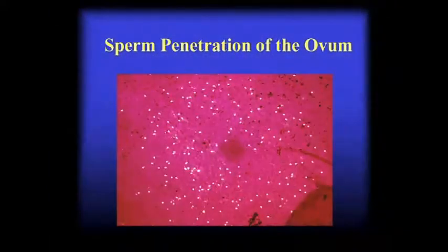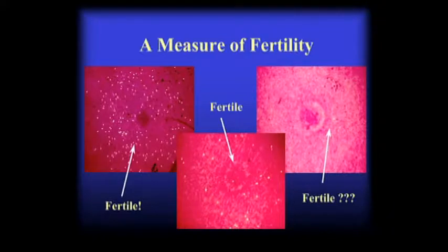This is what we should see — each hole represents an area where a sperm has bound and penetrated that perivitelline layer, so we're seeing light pass through that hole in a donut-shaped fashion. Here we can look at one with heavy penetration versus the small one on the right with very little sperm penetration but a couple of holes. From that point we record them on our record sheet, and what we want to look at is the distribution of holes across categories: 0 to 10, 11 to 30, and 31 to 60 percent. That data is what's going to be most important for determining what is wrong with our flock.